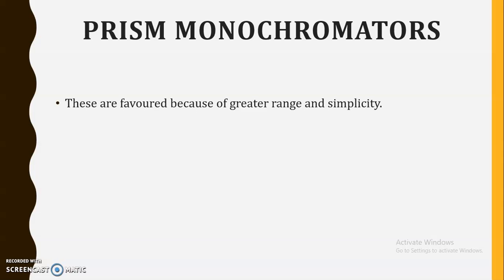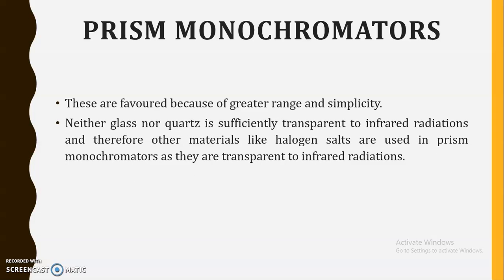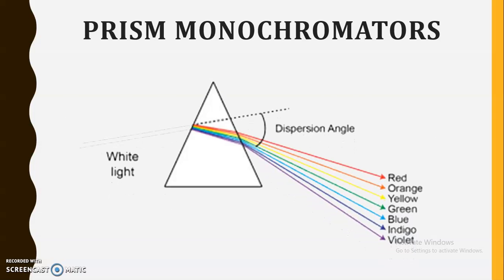First, we will discuss prism monochromators. These are favored because of their greater range as well as simplicity. They are cost effective also. Neither glass nor quartz is sufficiently transparent to infrared radiation, meaning glass as well as quartz absorb a certain amount of infrared radiation. Therefore other materials like halogen salts are used in manufacturing prism monochromators, as they are transparent to infrared radiation. This is a typical example of a prism monochromator, shown in the diagram. Generally the prism is made up of halogen salts like NaCl, KBr, etc.